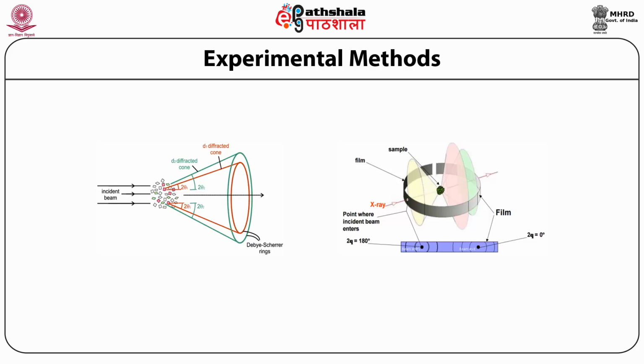With the help of this information, it is always clear which hole is for the incident beam and which is for the transmitted beam in the film.